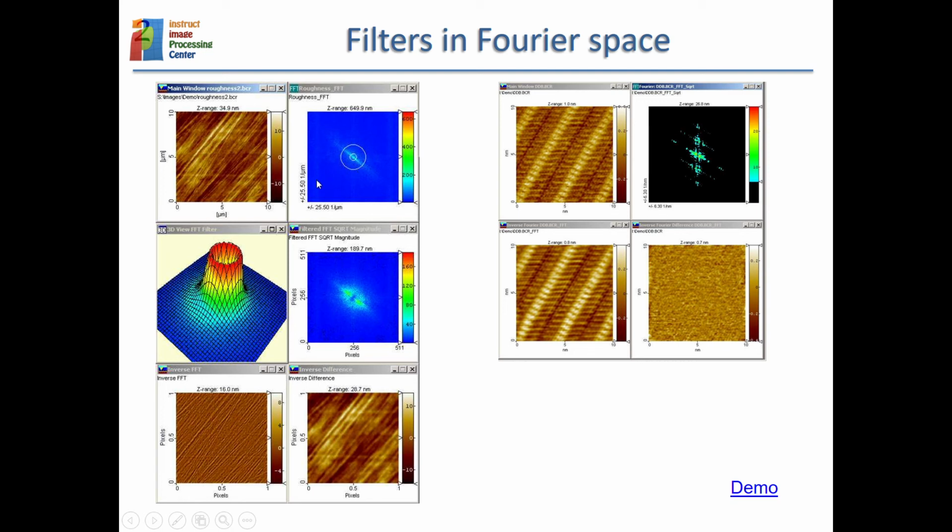And for this particular bandpass filter, after multiplying we have removed all the energy at the very low frequencies, so that is why you don't have it here. But you keep this energy in the donut, and then when you do the inverse Fourier transform, this is what you get. So you have isolated from the original image the components that are in this area of frequency, and these are these fine details. And if you compute the difference with the original image, then what you see is mostly the low frequency components that were killed by the filter.